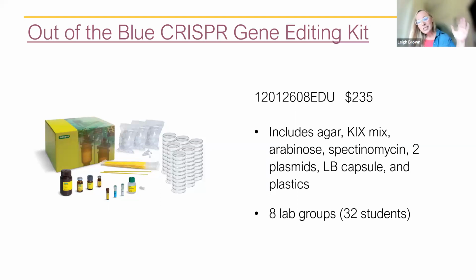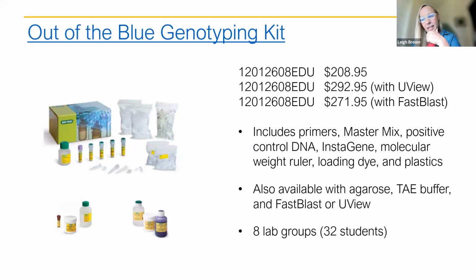Now, talking about CRISPR and all that is not included in that class period. There's a lot of teaching that needs to go on outside of that. There's also a genotyping kit where they can do colony PCR and see if they made the changes that they thought they made. Did they successfully edit the LAC-Z gene? Is it still intact? And they have a control DNA, so it's three different primers multiplexed together. That's a really nice lab if you have a thermal cycler.